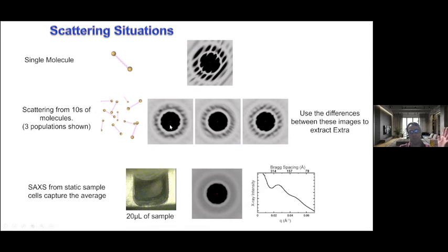And then if you were to allow them to move for a second, and then take a quick snapshot again, you get something like this and like this. So depending on the orientations, you would get a little less information than this, and each time it would be slightly different. With SAXS, where everything's moving all over the place, these profiles all get averaged, and you get sort of these less detailed images with less fine structure.